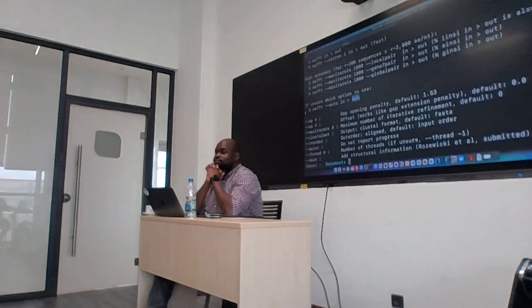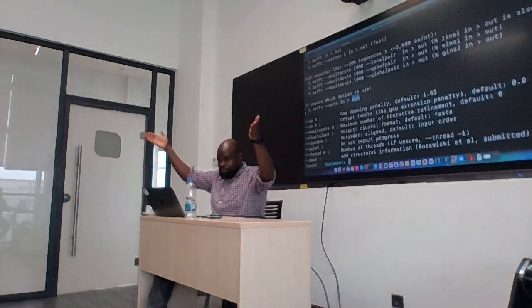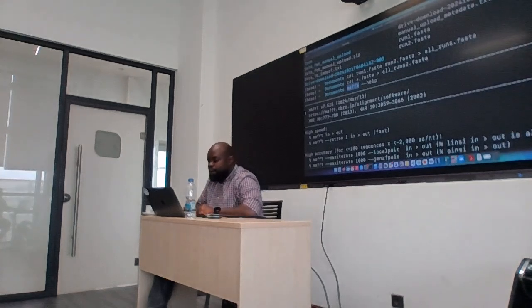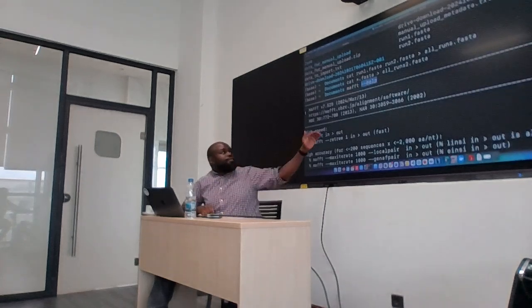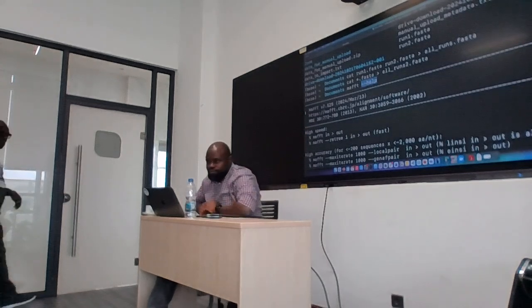I repeat. We've installed MAFFT, right? We have sequences that are not aligned. We want to align them. So, good practice, if a tool is new to you, always use the tool name and help, correct? So I did mafft --help. And I get this information here, as well as how to use MAFFT, correct?